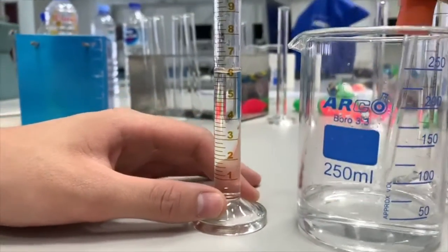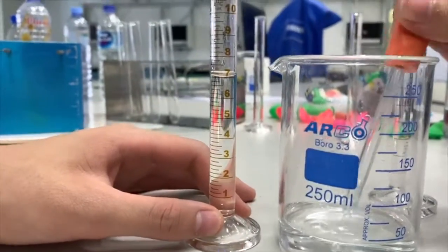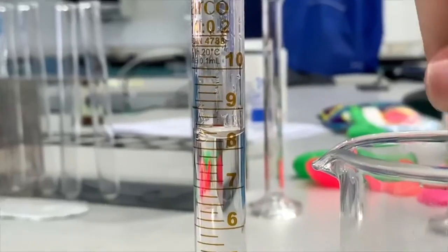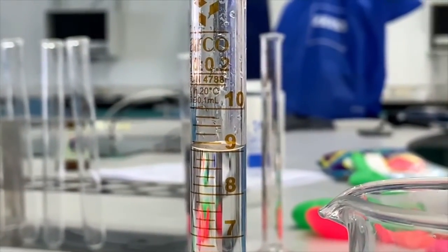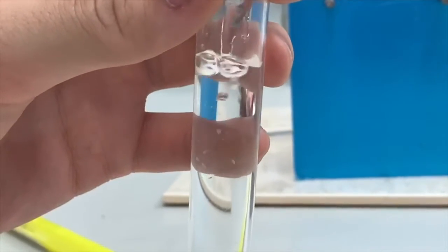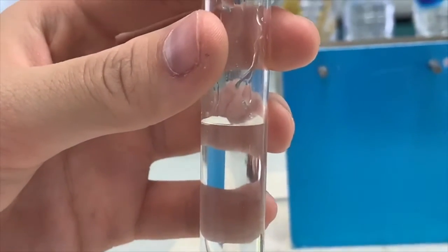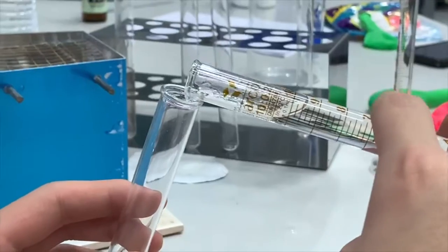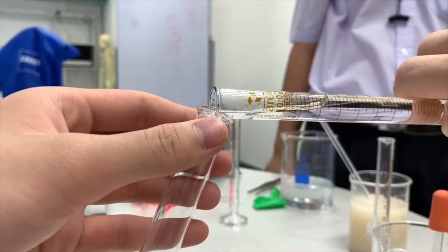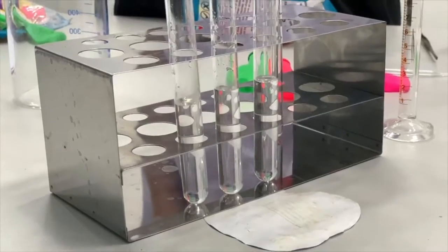And I'm going to talk about the result. In the first tube, there was no yeast, so the balloon didn't bloat. And for the second tube, we added 3 ml of yeast into the tube, so the balloon bloated just a little bit. And for the next tubes, we added 6 ml and 10 ml of yeast into the tubes, so the balloon bloated accordingly to the amount of yeast.